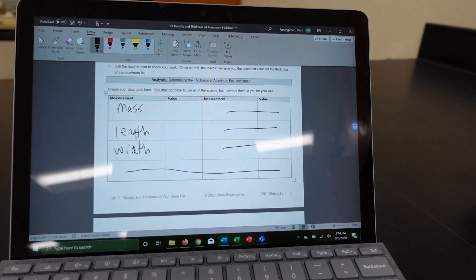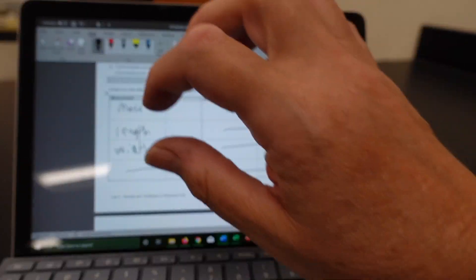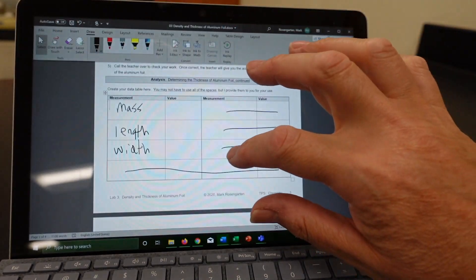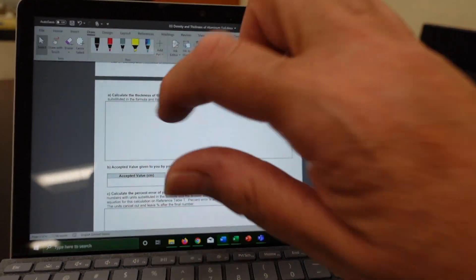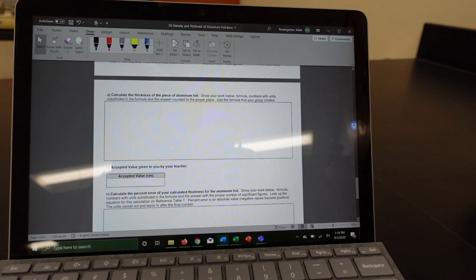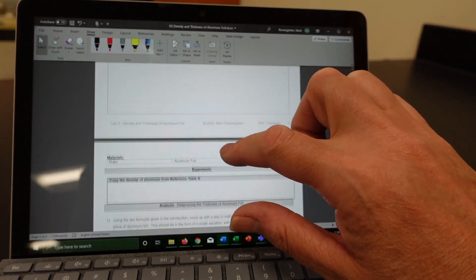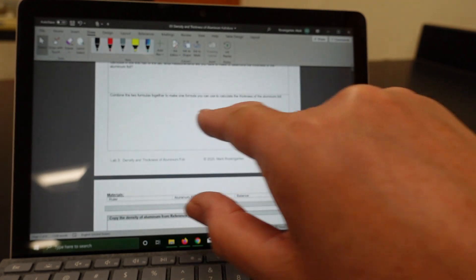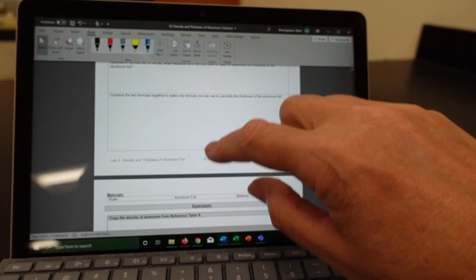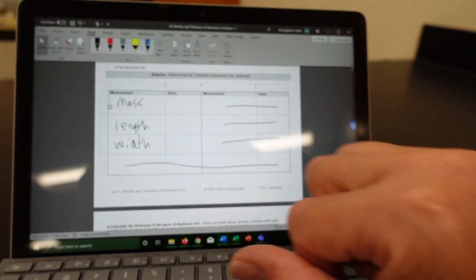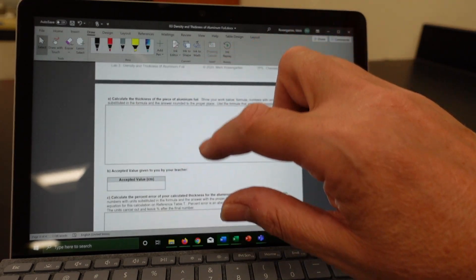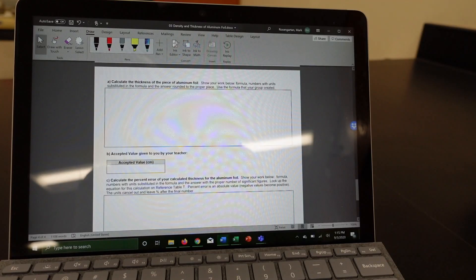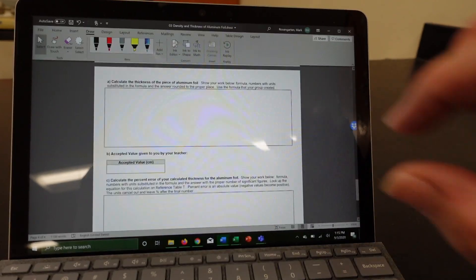So what do you do from there? The next thing that you do is you're going to calculate the thickness of the aluminum foil. How are you going to do that? You know what the formula is that you need. And you know what the mass, the length, and the width is. Just substitute in with the density to find the piece of aluminum foil.